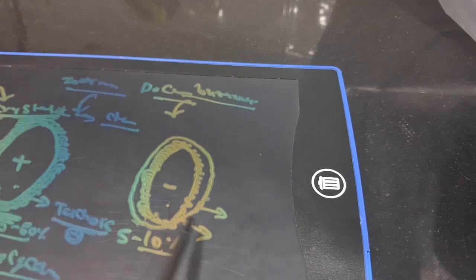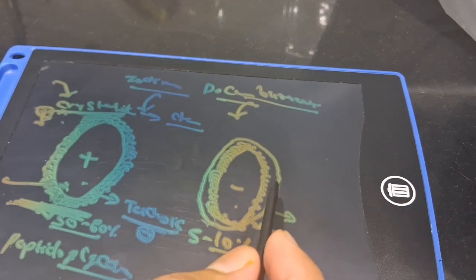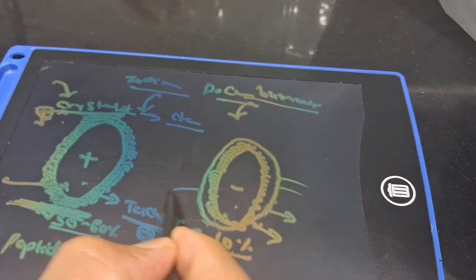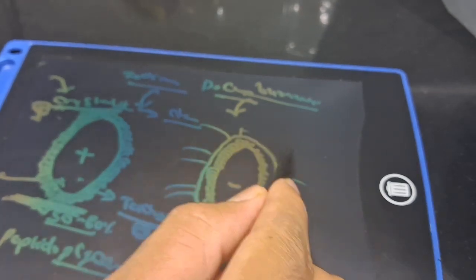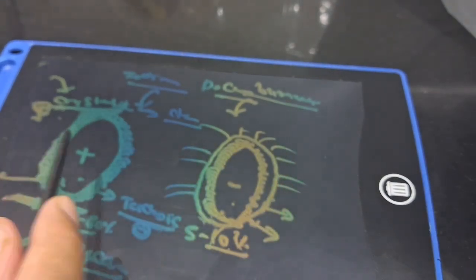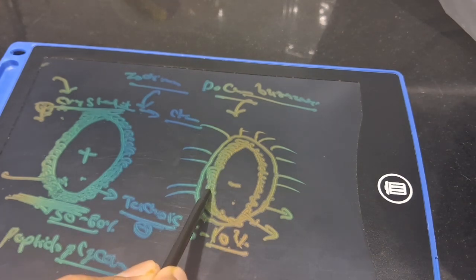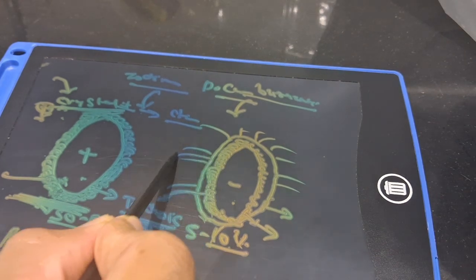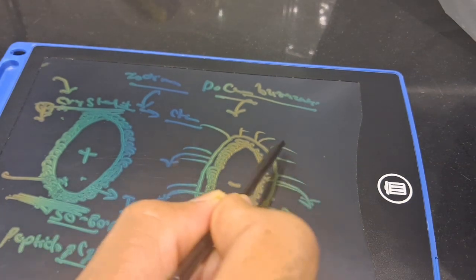But as you apply the same acetone on the gram negative bacteria, you will see that the membrane of lipopolysaccharide will be ruptured because of acetone. As soon as it is ruptured, the thin layer of peptidoglycan will release the chemical complex of crystal violet and Gram's iodine out of the cell wall.